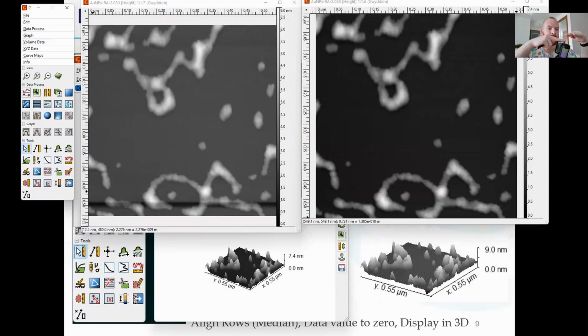So for example, this is my surface, this level, and this is something lying on the surface. So I scan first the substrate and then my sample. And what I measure is the difference between substrate and my sample. It's not the absolute value, it's a relative value. It's a difference. That's why we can zero it whenever we want. Here or there, because you remember here it was minus 1.3, right? And now it's 0. So we just move the scale a bit.